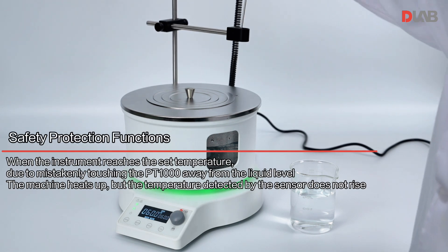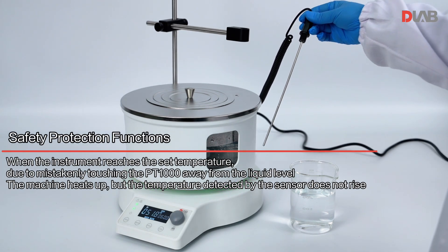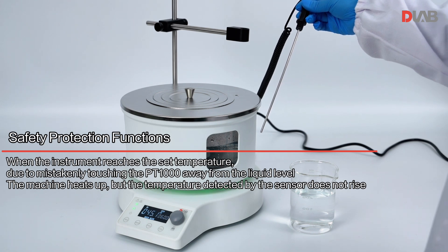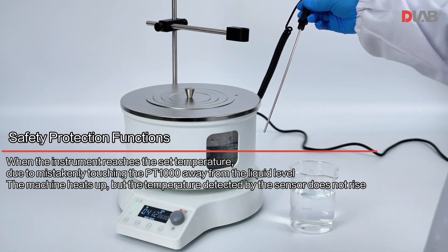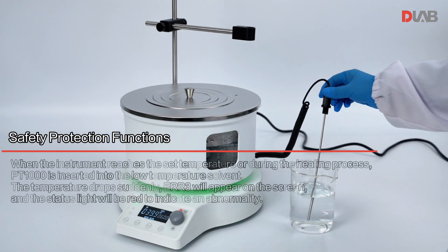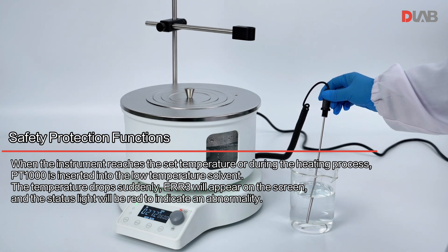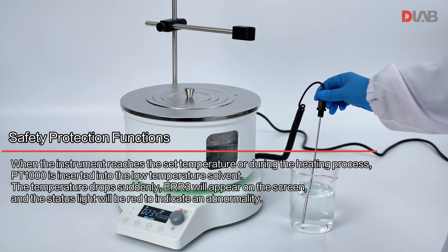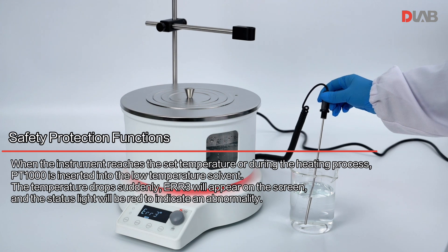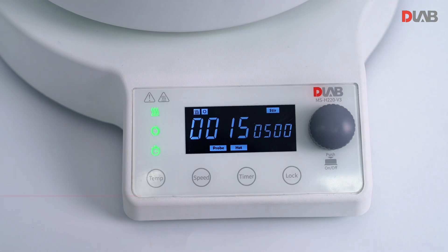Safety protection functions: when the instrument reaches the set temperature due to mistakenly touching the PT1000 away from the liquid level, the machine heats up but the temperature detected by the sensor does not rise. Additionally, if PT1000 is inserted into a low temperature solvent and the temperature drops suddenly, ERR3 will appear on the screen and the status light will be red to indicate an abnormality.